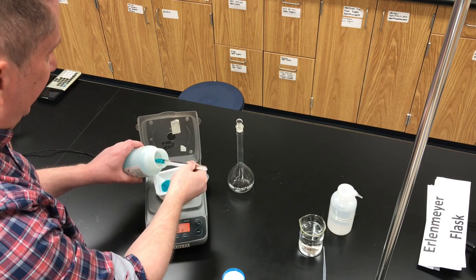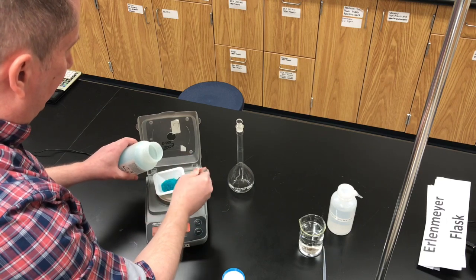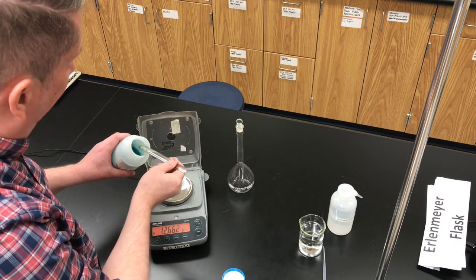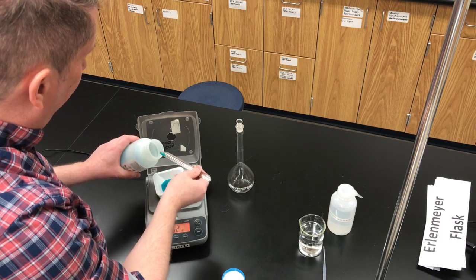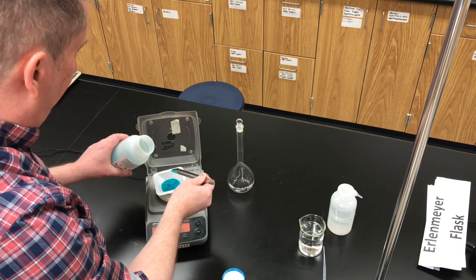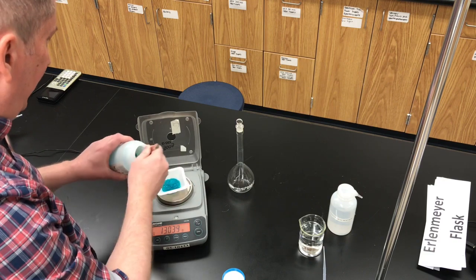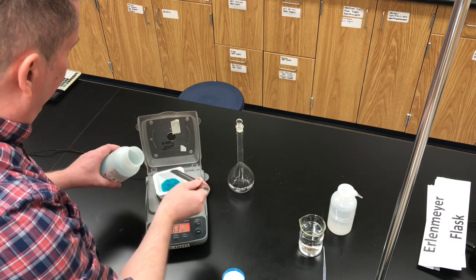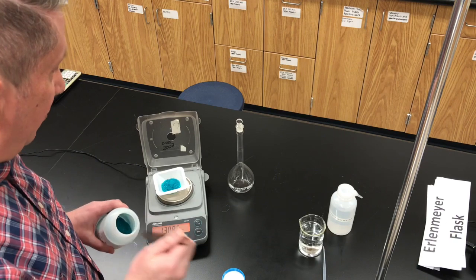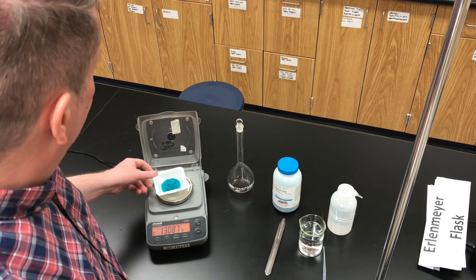Let's hold the bottle of solute directly over the balance as we add the chemical. 13.1 grams is going to be a pretty large amount, so let's put some large scoops in. We're at 12.7, so let's slow down the addition — now 12.9, now 13.0. Let's add a little bit more. 13.08, when rounded to one decimal place, is 13.1, so we're done. There is the 13.1 grams of nickel sulfate.